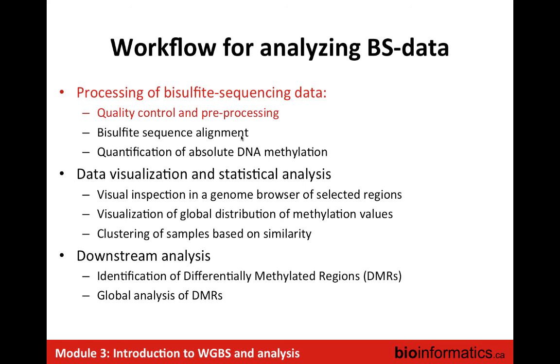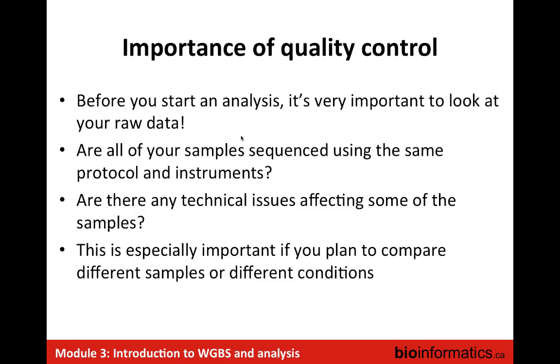First things first, quality control and pre-processing. This was already highlighted yesterday, but it's really important before you start the analysis to look at your raw data. That's actually not what we'll do in the lab, but it's highly recommended that you look at the properties, as you did yesterday with the ChIP-seq data, using tools like FastQC.